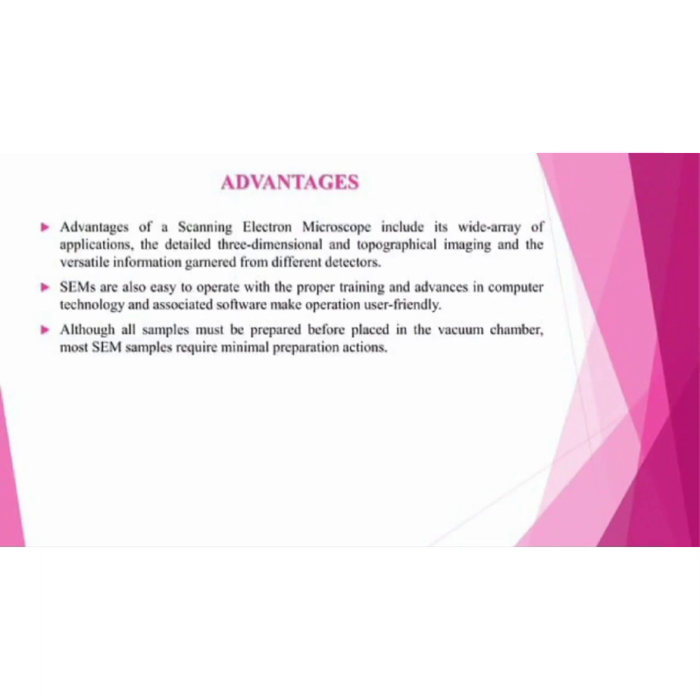All samples must be prepared before being placed in the vacuum chamber. Most SEM samples require minimal preparation. These are the advantages of SEM.